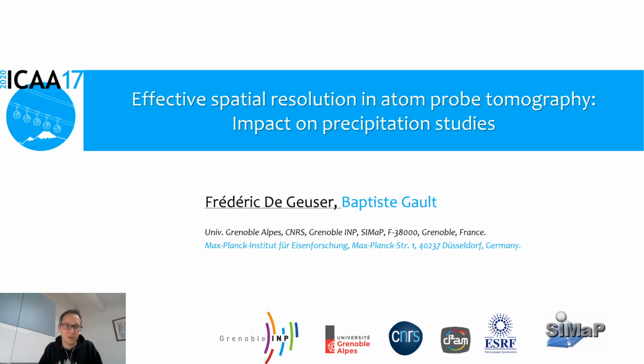where the actual ideal spatial resolution of Atom Probe is usually measured in pure alloys or in pure elements close to crystallographic poles, etc. So this is not the case here.